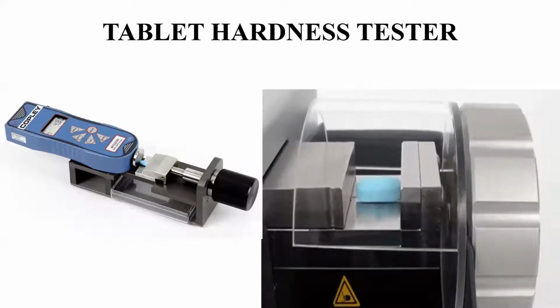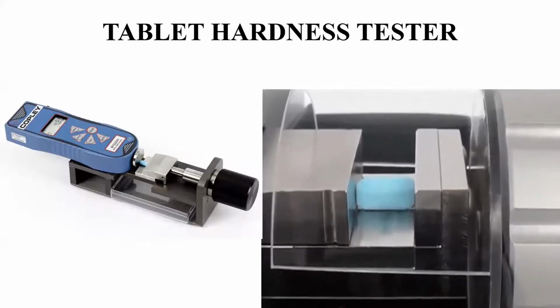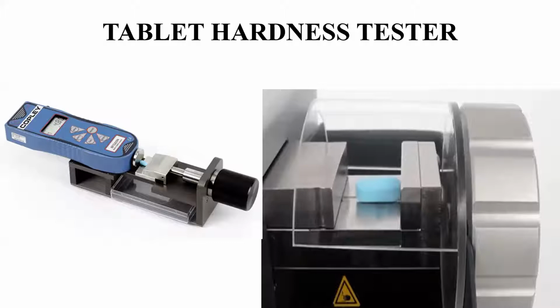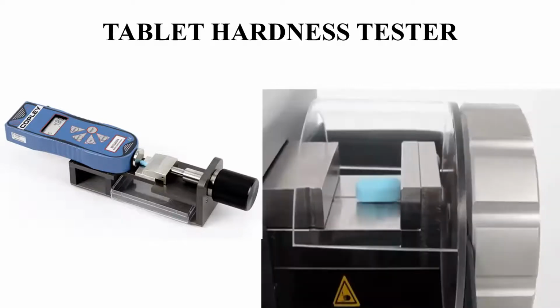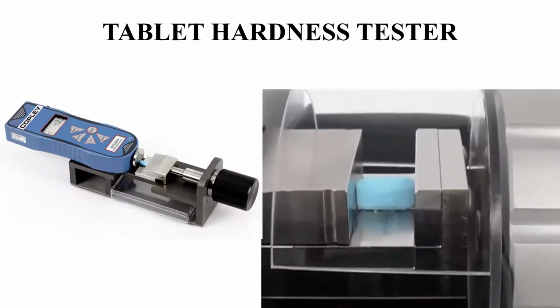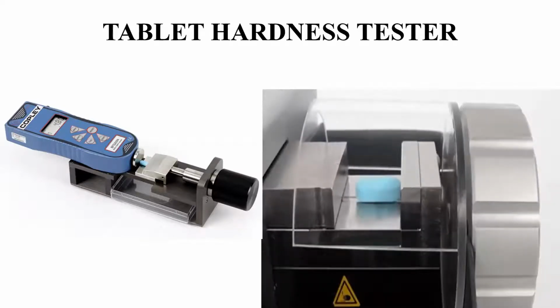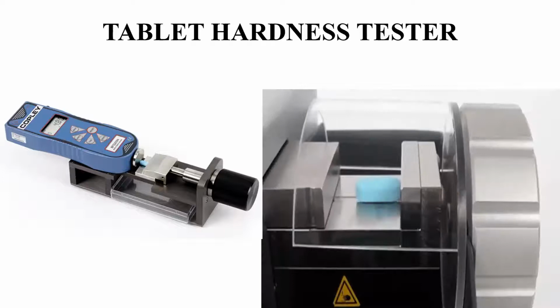By zooming this, easily you can understand the size of this hardness tester should be fixed as per the size of the tablet. Then on the pressure, hardness should be tested. If there are some material residues left behind after completing the test, we can record the hardness using the control panel.